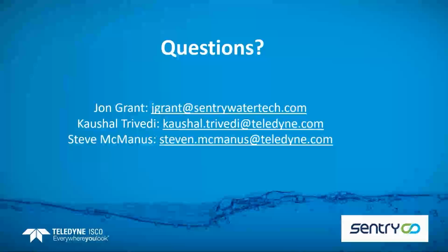Steve McManus is also with us, and we do have a sampling question for you, Steve. Can you also do volume-based event sampling? Is that possible? For all intents and purposes, flow-based sampling truly is volume-based, because you're configuring the sampler so that it collects a sample every fixed amount of volume that has passed through the monitoring location.